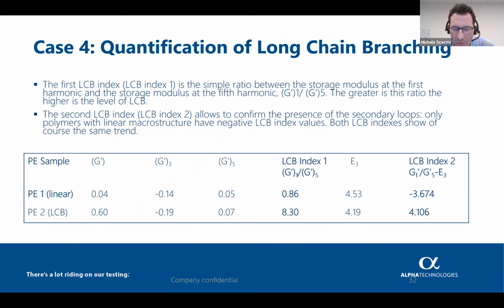The way to check if the material doesn't have any issue related to melt fracture is to check with the LAOS, with these long chain branching indexes.